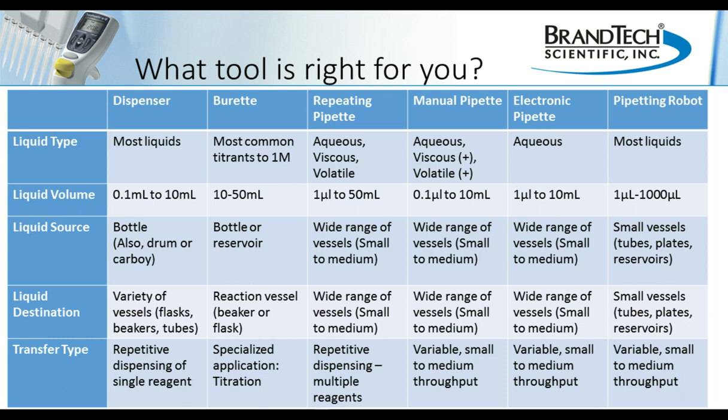different liquid types. Electronic pipettes can also be used to increase reproducibility of manual processes, and repetitive pipettes can be used for repeated dispensing of small volumes. Finally, if you see your laboratory with increasing throughput liquid handling needs, you may consider a switch to automation.